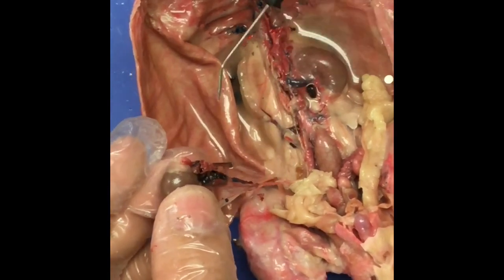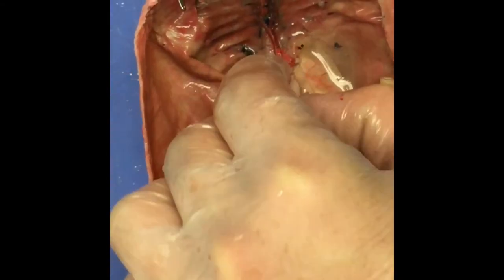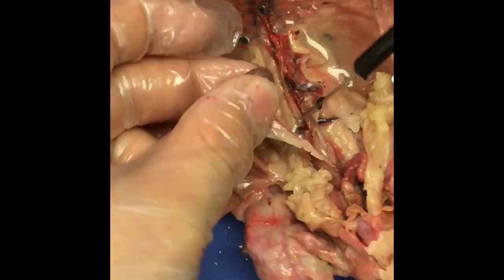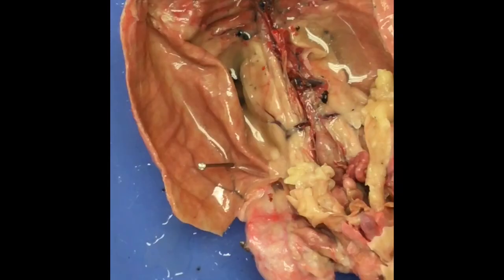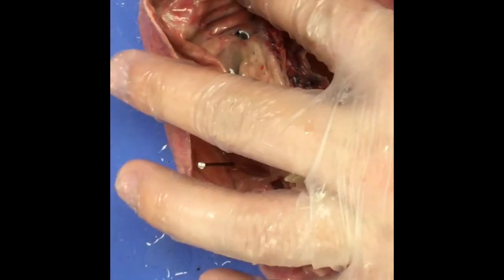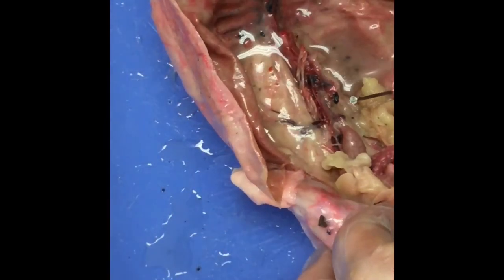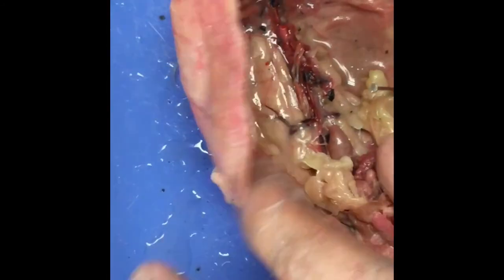So, here you go. That is going to be your ureter. Carefully remove it. You have your other kidney. You'll notice one was a little higher than the other. So, here you have your other ureter. Carefully remove it. Mr. Mount, is that water in it? This is more of that propylene glycol in water. That's the preservative that helps keep it from rotting while it's being stored.